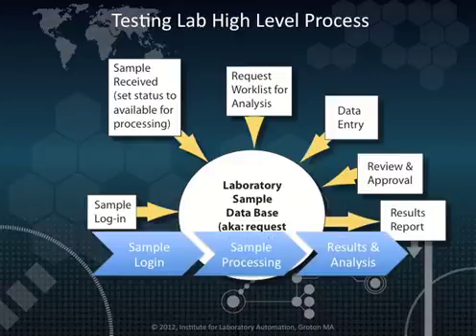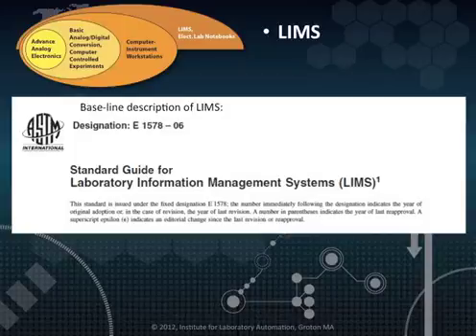As we talked about earlier, automation systems are built around processes, and LIMS database products are a perfect example of software built to implement a specific process. In the 1980s, when LIMS first became popular, there was a fair amount of confusion about what they actually did and what was necessary to understand and buy them. Adding to the confusion were differences in terminology used by different vendors. That isn't too surprising because the words Laboratory Information Management System would seem to cover a wide range of activities.